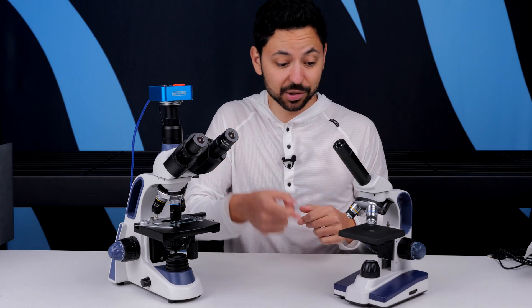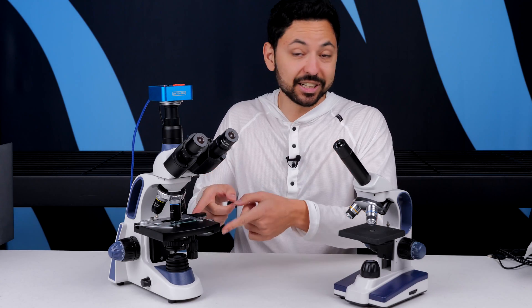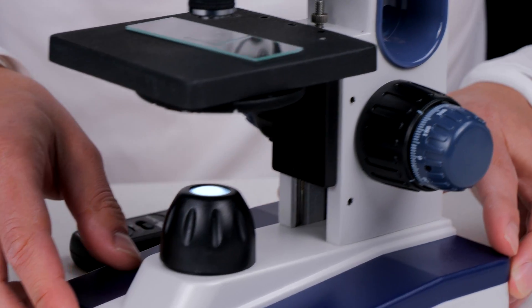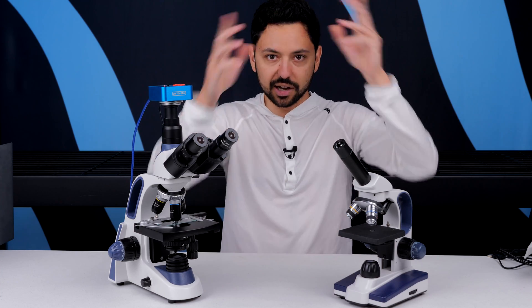If your microscope doesn't have a condenser, like the Horizons light microscope, that's totally okay — optically, this is the exact same thing as having a condenser with the iris all the way closed down. The LED is just shooting the light straight up rather than going into a condenser to get angled toward the sample.